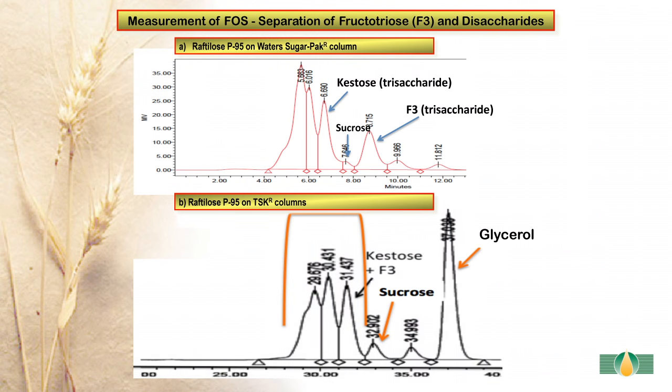In the measurement of fructooligosaccharides using the Waters sugar pack column, a problem is experienced. Fructotriose, which is a major component, elutes after sucrose and thus is not measured. This problem is not experienced when using the TSK columns, where fructotriose elutes as a trisaccharide and is included in the dietary fibre value.